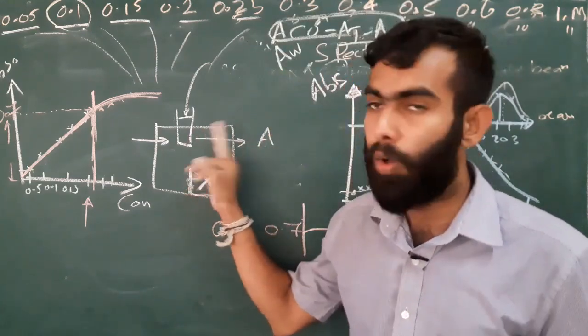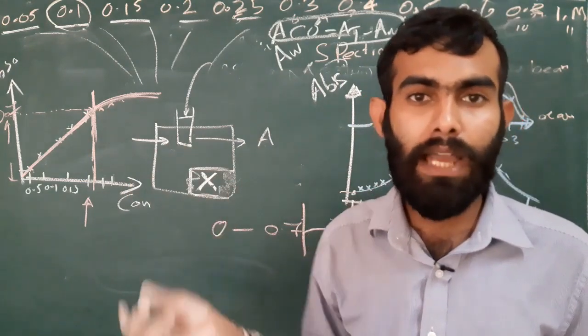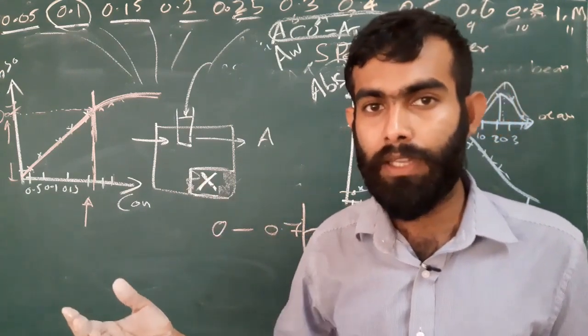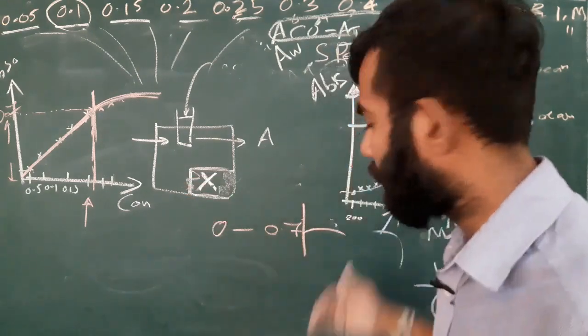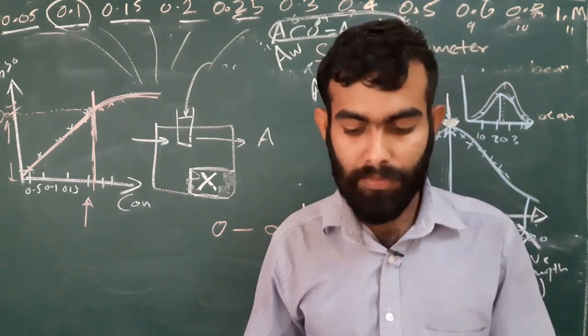And the sample cell also, first tap water, next distilled water. After that we have to rinse it with the relevant solution. However, we will not dry it in an oven. We will use tissue papers to dry the outside. Okay. I explained everything. I think this is the end of this experiment number 7.